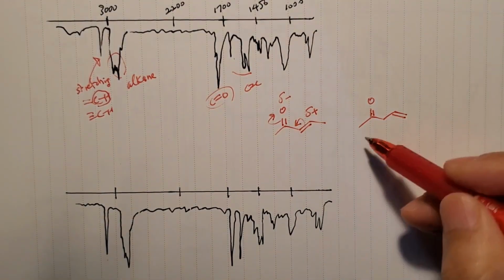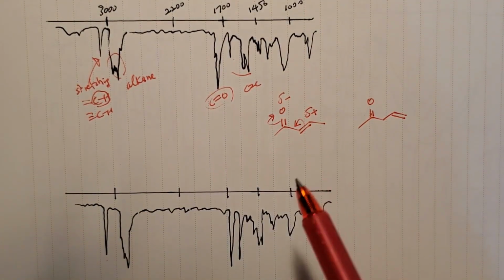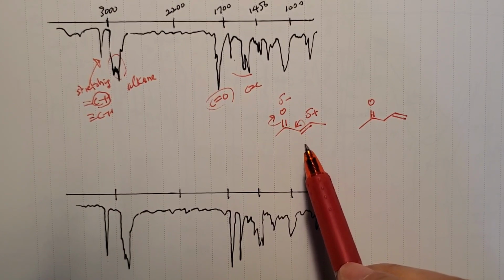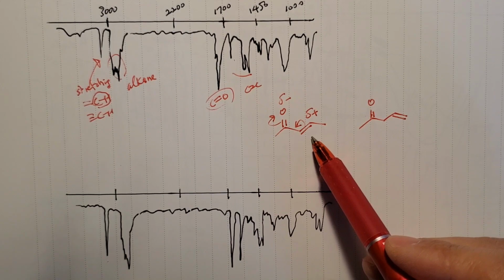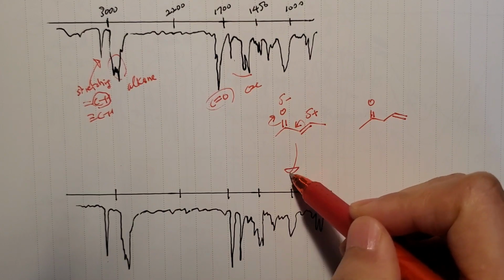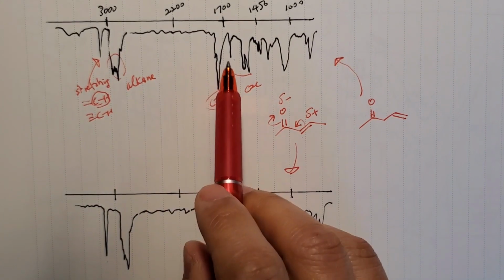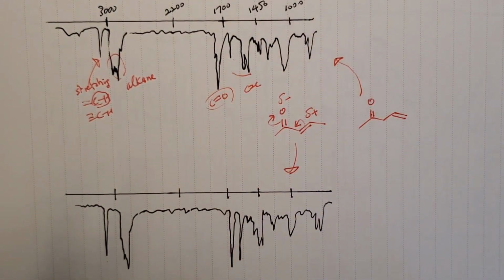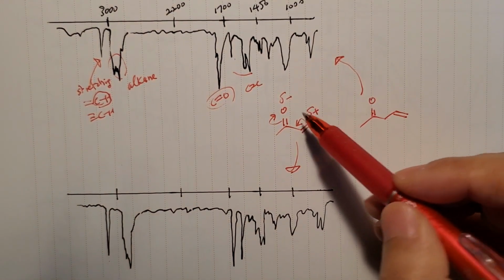Here you cannot have a resonance, so you can say the more polar signal came from the one matching this structure better, and the weaker signal for alkene coming from this one matches and explains this structure better. When you do synthesis, you'll see this type of comparison. Then also that explains the CO double bond.